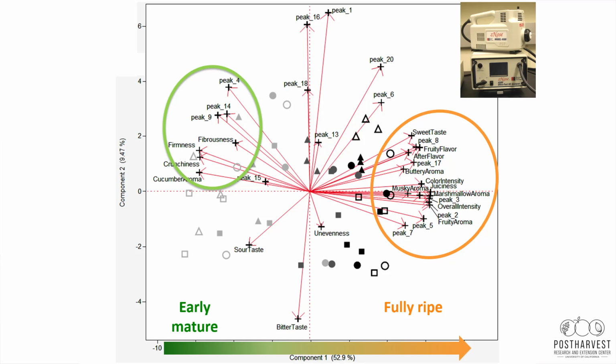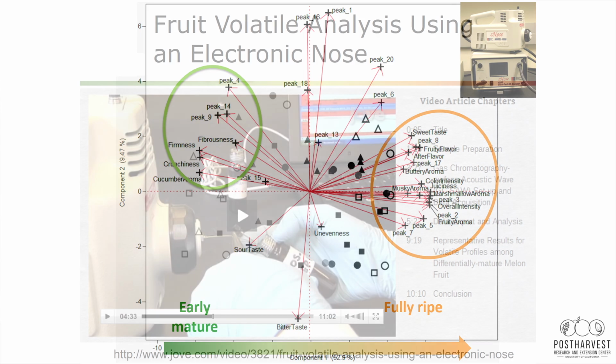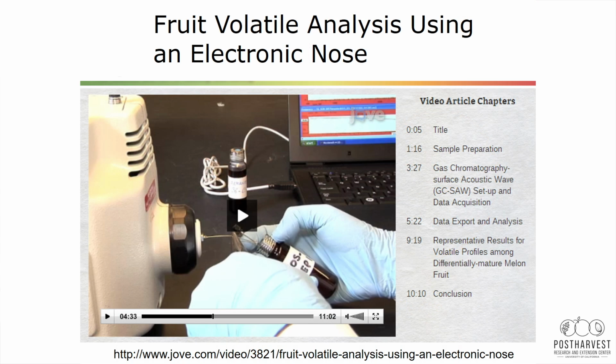But research-wise, this was definitely interesting that we got a similar grouping of compounds from the gold standard to the electronic nose, and that's actually Simona's hands right here using this electronic nose thing.